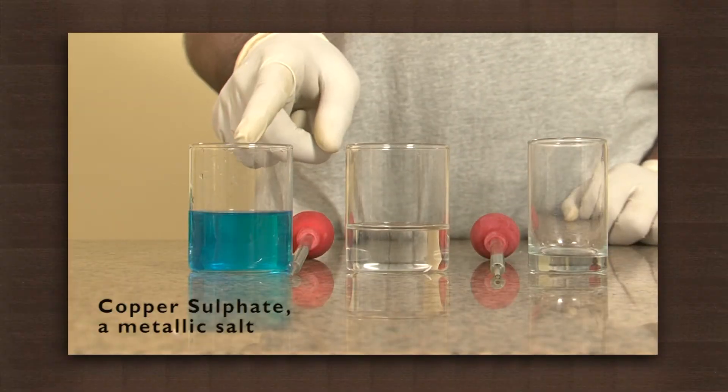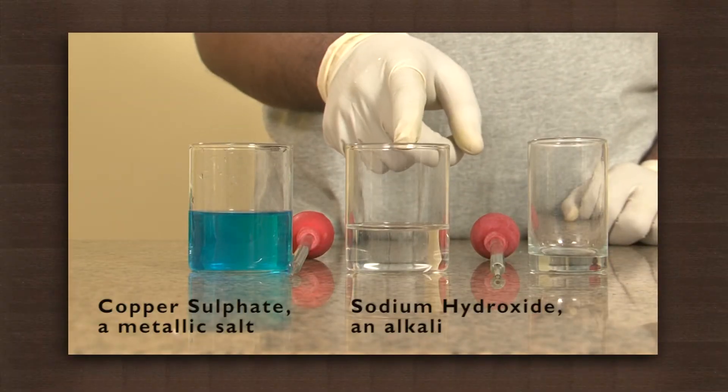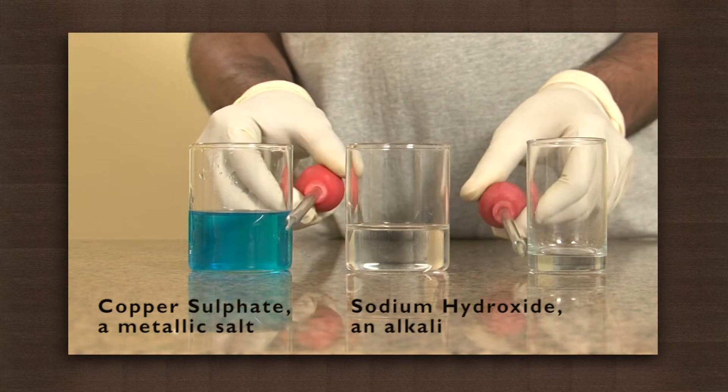For this, we need copper sulfate, which is a metallic salt, sodium hydroxide, a small beaker, and two droppers.